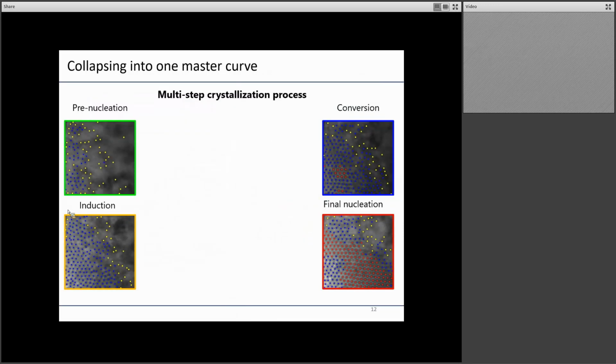And then we can come back to real space snapshots collected from the movies. You can see clearly that before nucleation, the system is very dilute, which we label here as yellow. But then the particles begin to concentrate locally, and the dense liquid-like states start to appear, labeled in blue here. And then as the disordered blue domain grows, some crystallized regions, labeled as red, start to renucleate from within until it is fully converted to the crystalline region.